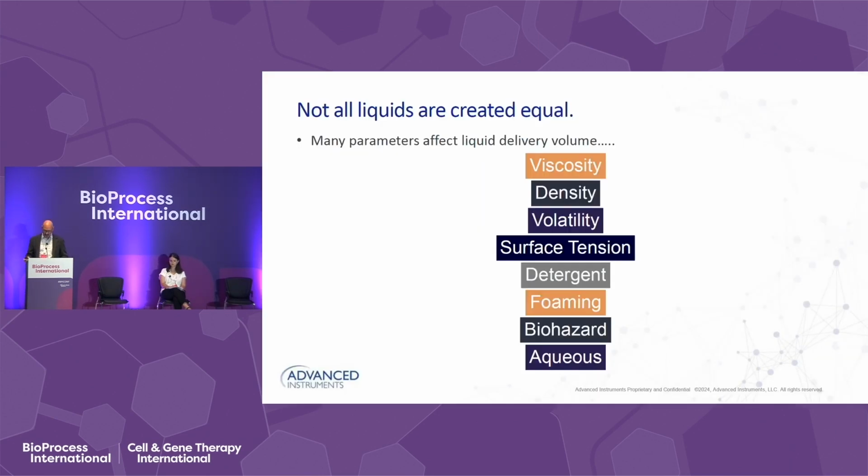The first thing we need to look at, one of the most important factors to assure proper assay development and outcomes, is to start with the liquid that you're using in the assay. Adjustments to your liquid handler are designed to increase accuracy and precision of liquid transfers and decrease variability of the assays and assay results, and even false results. Therefore, the type of liquid you are working with will have an impact on the accuracy and precision of your liquid handler. Thusly, it's critical to accurately replicate the liquids when you're setting up your ALH.